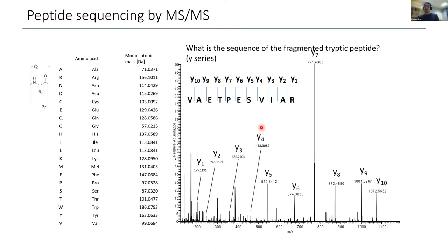So you see, it is possible to do this. And if I would have given you more time, I'm absolutely sure you would have solved the complete sequence. The main problem is our mass spectrometers are now relatively fast, and we easily acquire hundreds of thousands of these MS2 spectra in an experiment. So that would take quite some time to go through each spectrum manually.